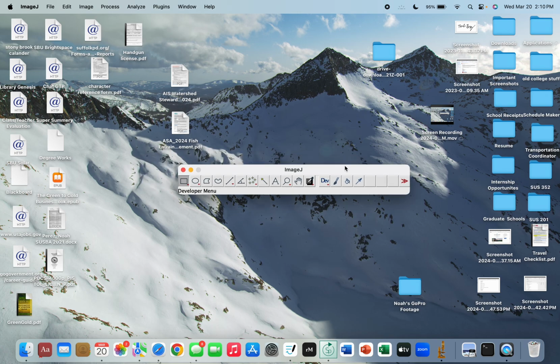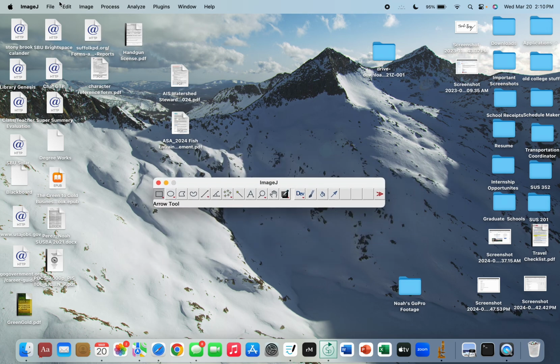I'm just gonna make this little video to show everybody how to use ImageJ, as well as where to put the data if anybody's confused. Down here is the program we're using, ImageJ. This is gonna be the main tab we're using, as well as this top bar here.